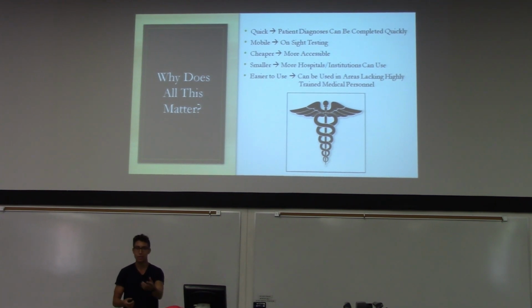It's also smaller, as you can see. You can put that as well as all the necessary components, such as a computer and voltage supply, in a backpack. Also, it's easier to use. It's pretty simple. So in areas where they need something like this but don't have the trained medical personnel, it can be taught more easily.